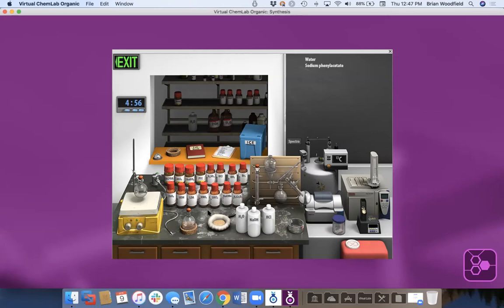So we're going to allow them to pick any combination of those starting materials with any of these reagents under any of these reaction conditions. Yes, we allow for that, but we don't allow, for example, these guys are off. The permutation table was impossible if we allowed them to have the stock room open still and add things while they were going.